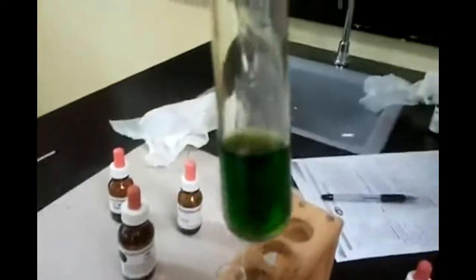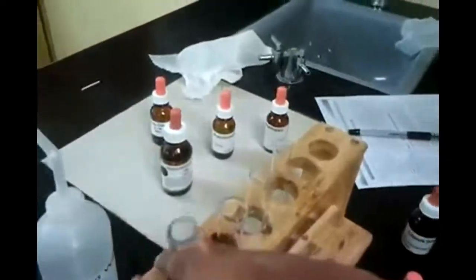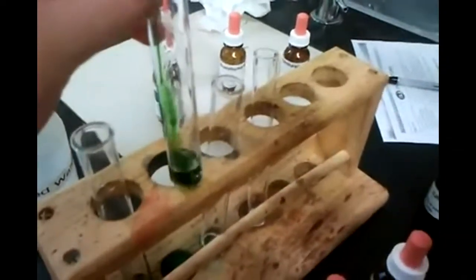We're using universal indicator. You should have used this in June. This is already green — water should be green because it's neutral. Remember how the color changes from red to purple. So sodium chloride should also be green because it's a salt. See, that's green.